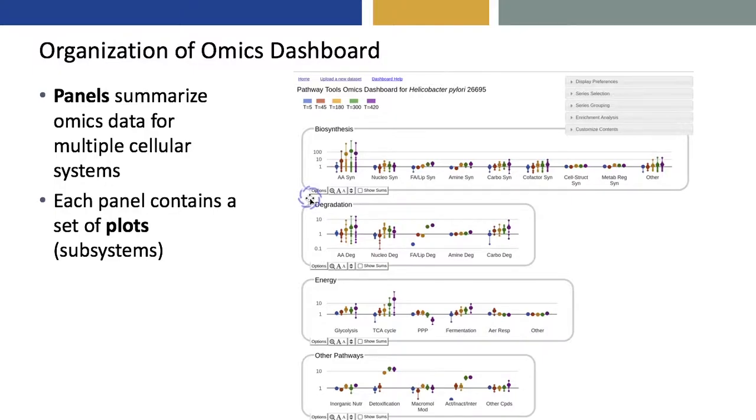And the set of metabolites on one vertical line are all the metabolites in that subsystem for which data is available. So you can't really, at this level, resolve these visual points too well, but the idea is that we're plotting here all of the metabolites involved in amino acid biosynthetic pathways within each of these vertical bars. And finally, the large point is the average of all the metabolite values shown for that plot.